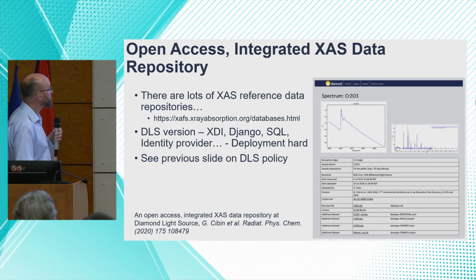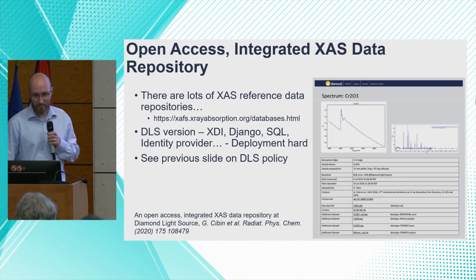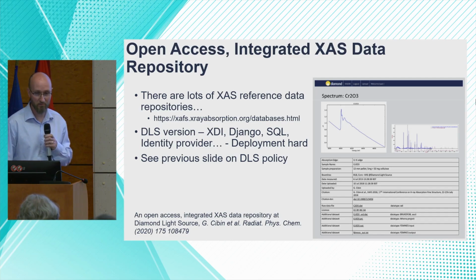So the other application I was talking about is the XAS data repository. Again, we made this 4 years ago, and yes, there are a lot of XAS reference data repositories.